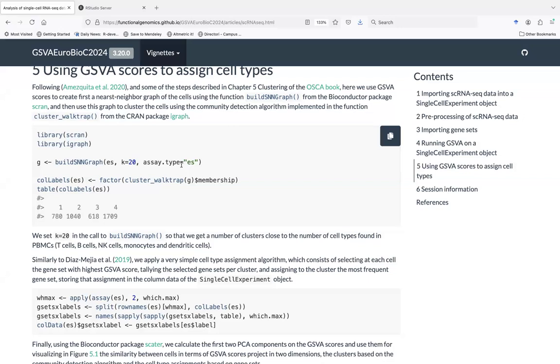Before, in the previous versions, you only had to be aware whether the data that you were giving were continuous or discrete. And now in this new version, the algorithm is going to look at the data and decide by itself whether it's going to be discrete, because in certain regimes it uses a non-parametric estimation with Gaussian kernels or Poisson kernels, and now it's making this decision automatically.